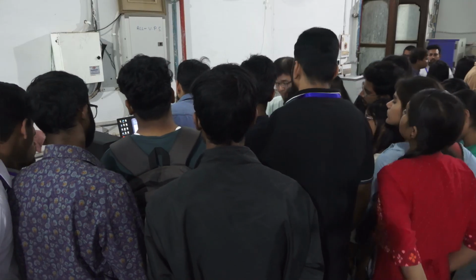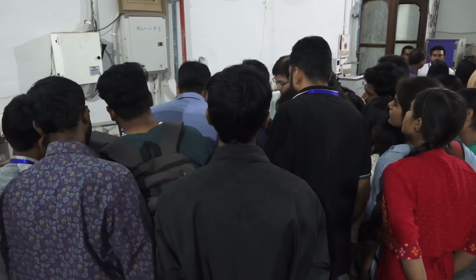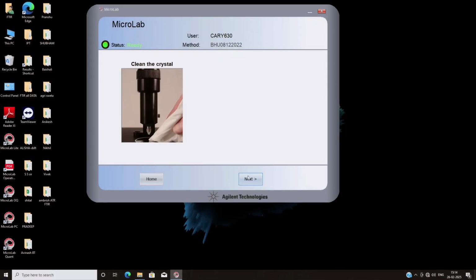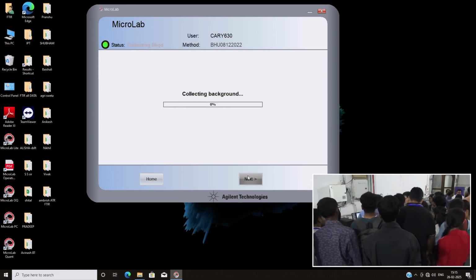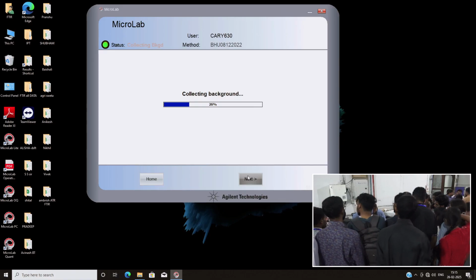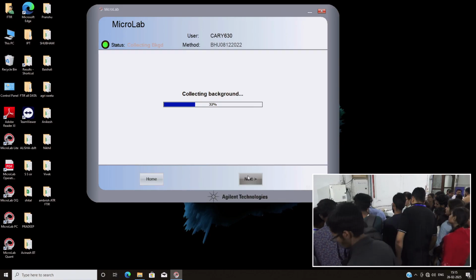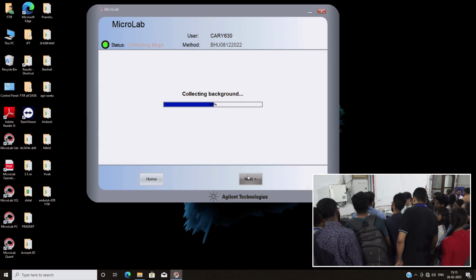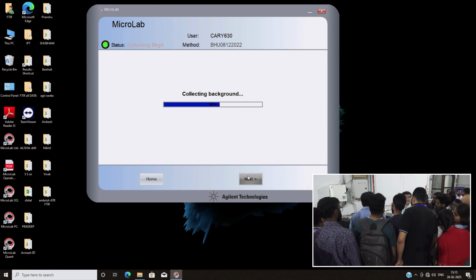The sample and FTIR crystal is here. So it is touched to air. So no sample. Okay, we need to be patient.